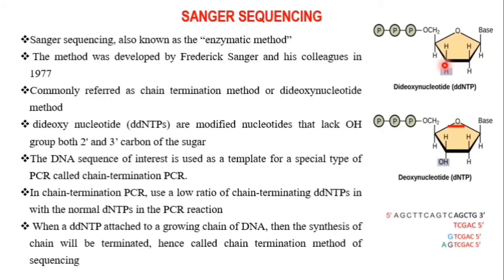If there is no hydroxyl group in the third position, then when we are adding nucleotides into the PCR reaction mixture and this dideoxynucleotide is attached into the growing chain of DNA, the 3' OH is not present in this dideoxynucleotide.